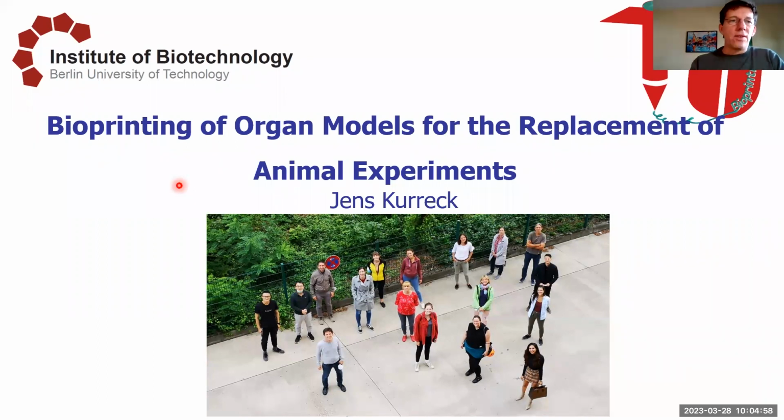As you can see in my title, I will talk about bioprinting of organ models, and we intend to use these organ models for the replacement of animal experiments. All the research I will present today was, of course, not done by myself, but rather by my co-workers.